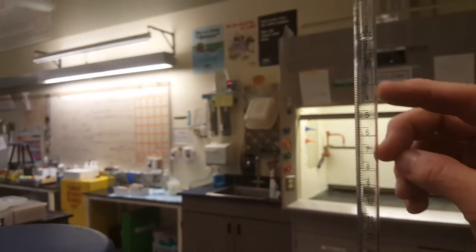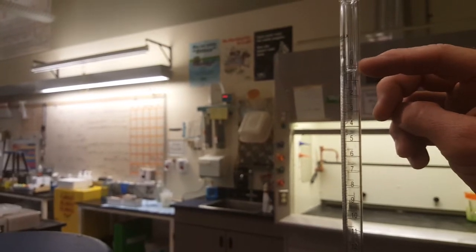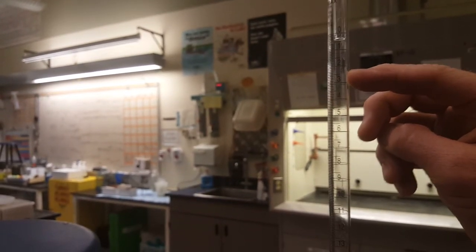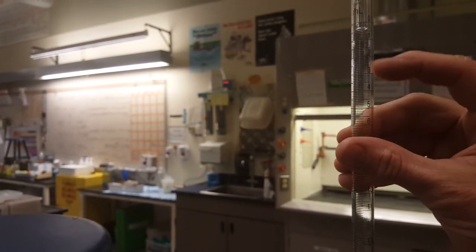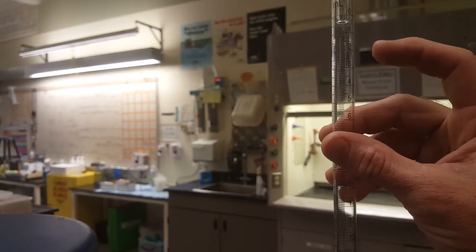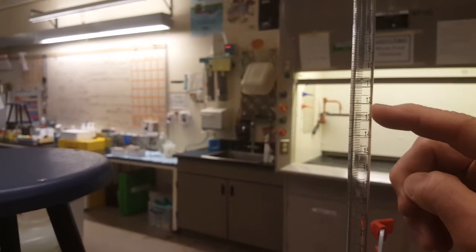So that means when you pour your sodium hydroxide in through this funnel at the top, you don't have to pour it up to the 0 mark. Any number up here towards the top should be enough, and write that number down. Now, since we have lines that go to the 10th of a milliliter, you'll have an uncertain digit that is at the hundredths of a milliliter. That's your initial volume.